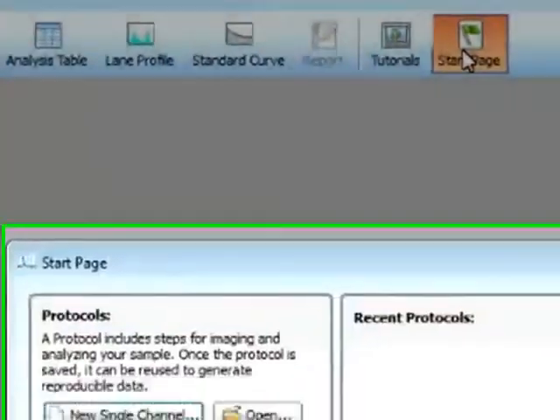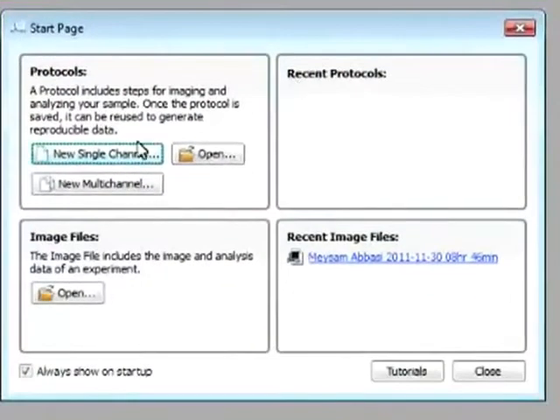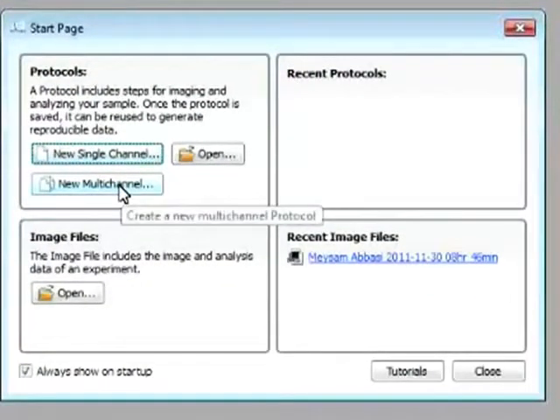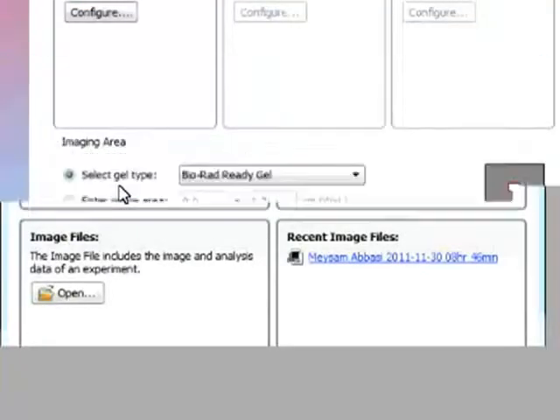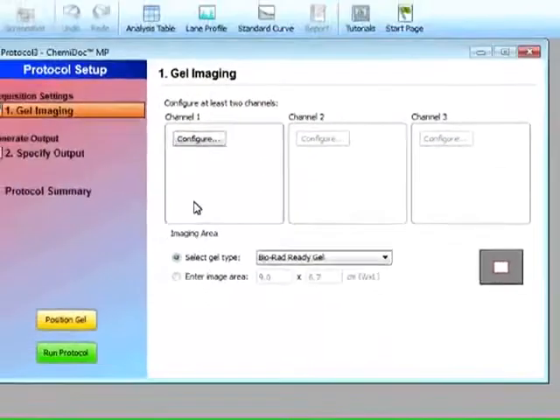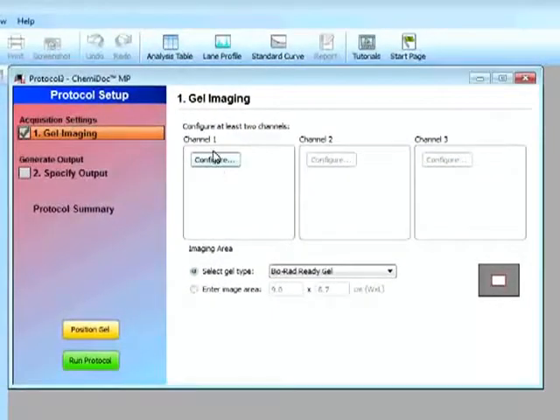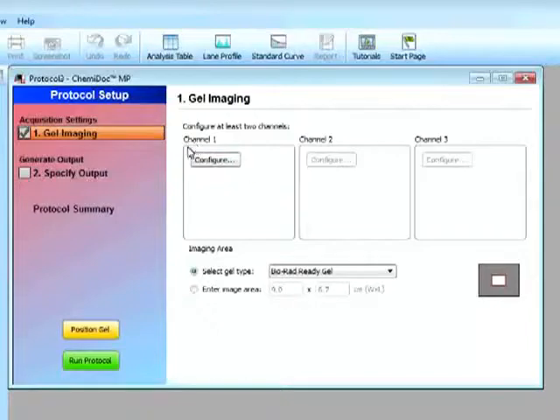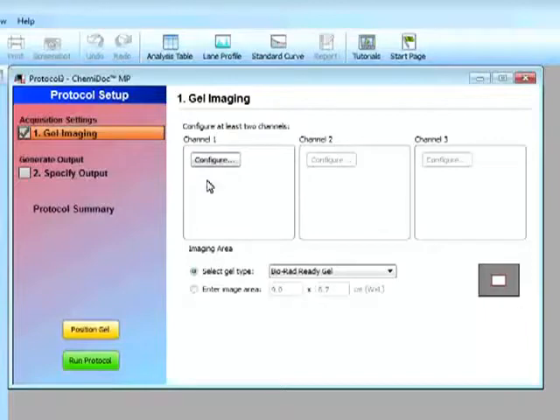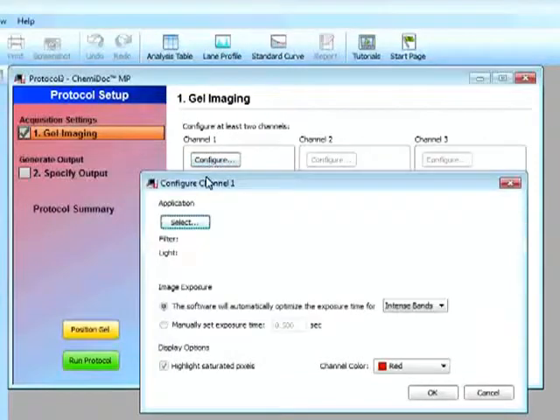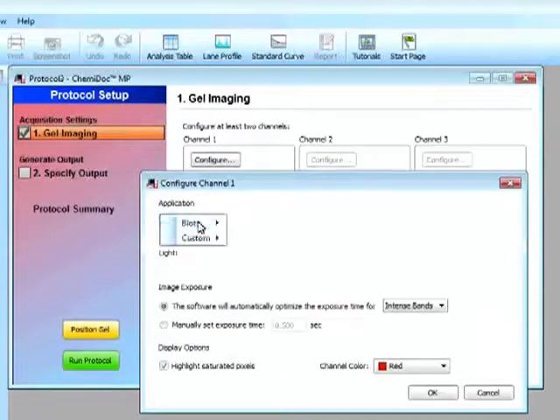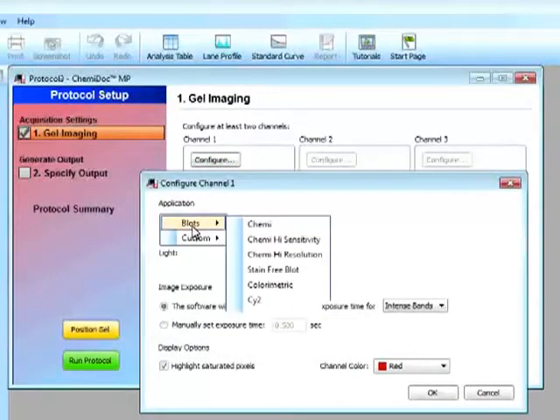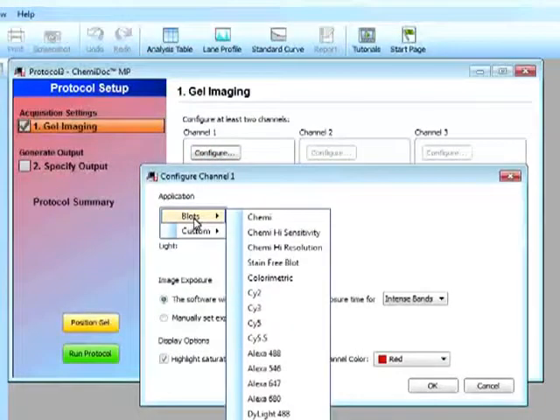So let's look at a new multi-channel image. So if I click on new multi-channel protocol, I can select a specific protocol for channel one, channel two, and channel three. So the nice thing is I can select a blot.